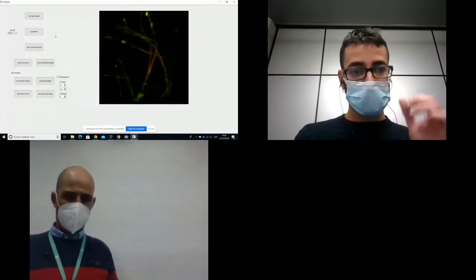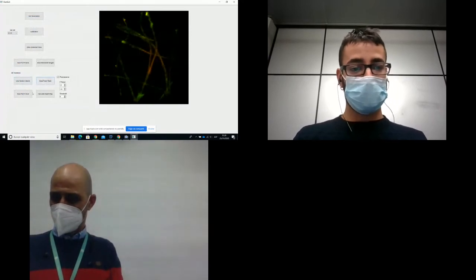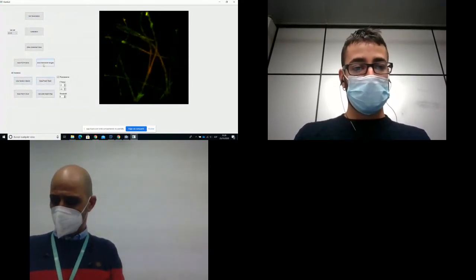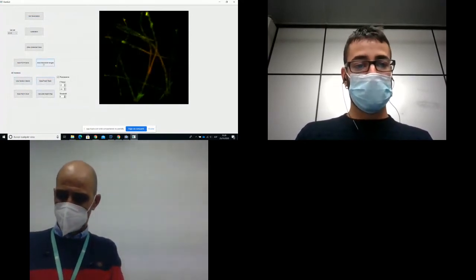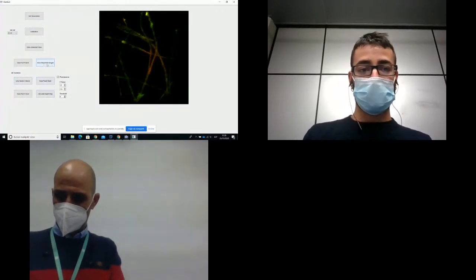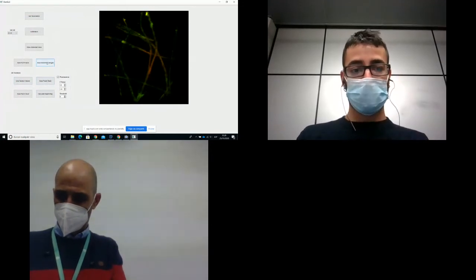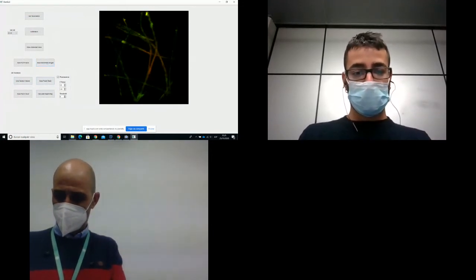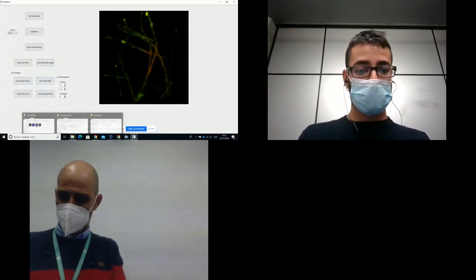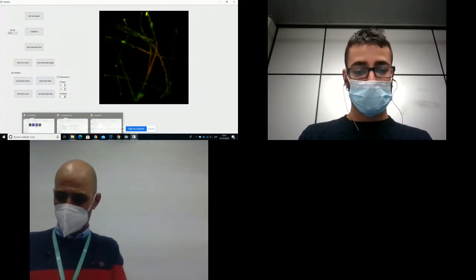Now, once you have set the focus stack or the depth map, you can save the elemental images too, that are the different perspective views of the sample, and you can use all this information with our visualization software, for example.